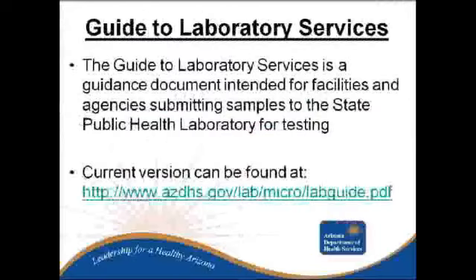All right, the Guide to Laboratory Services is a document that we've created, a guidance document that lets submitters know what type of samples to collect and which ones to ship to us, as well as what type of samples you should be collecting per the test requested. This is a document that is revised annually. The current version is July 2010, and the current version can be found at the website listed at the bottom.